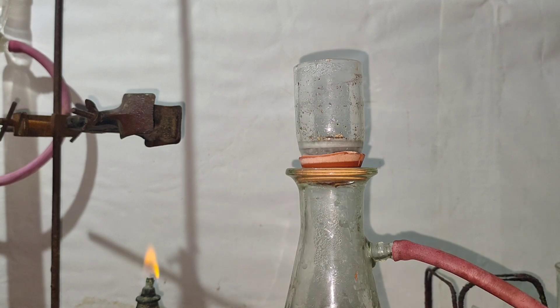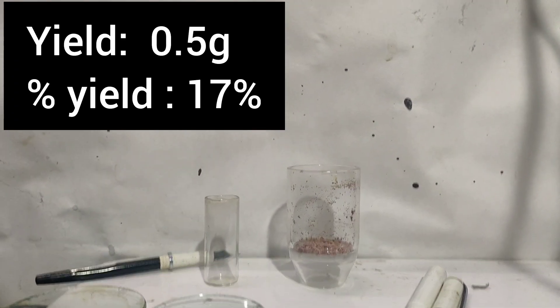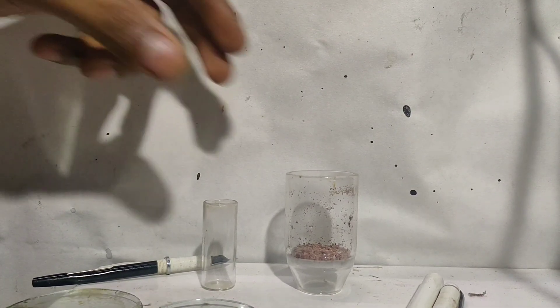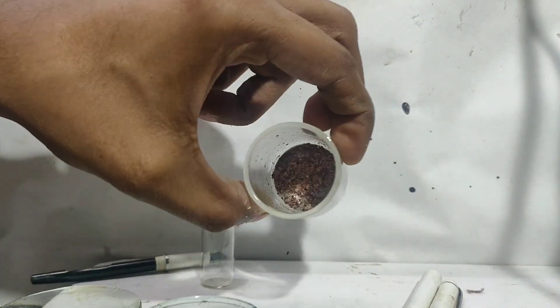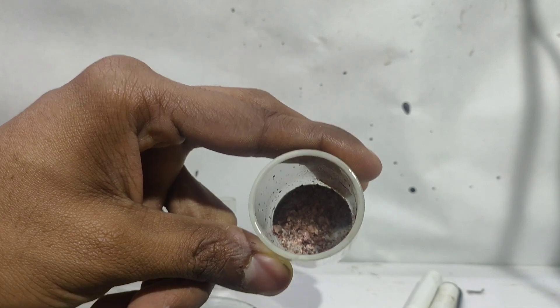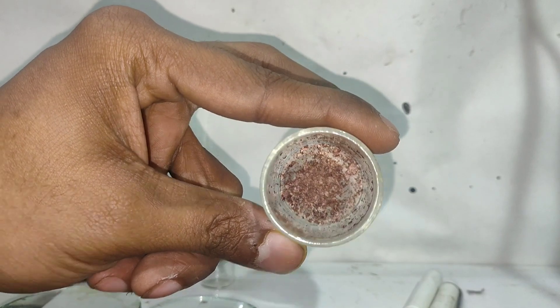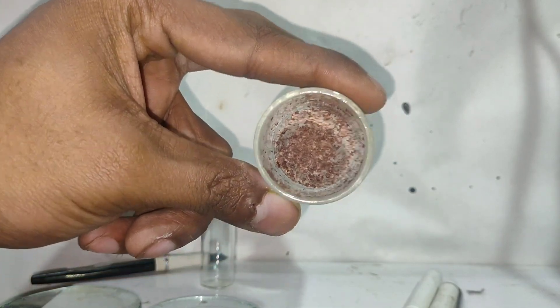This is done to remove the unreacted phthalic anhydride as phthalic acid. The final yield was 0.5 grams, which corresponds to a percentage yield of 17%. There wasn't much thymol phthalein in the water, so I'm not sure why the yield was so low, as there weren't many unreacted reactants remaining. Anyway, this much is sufficient for me.